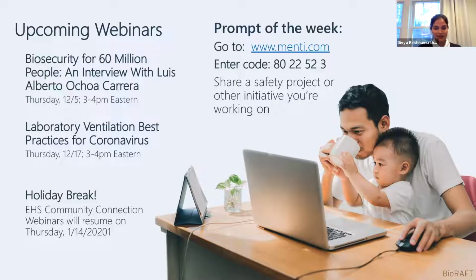So what it does is it reduces that problem, by having a chemical inventory that's available in a shared web space. That's where it's useful, right? Because everyone can look at it, filter by location, and if it's not there, then reorder it and plan for your work better.